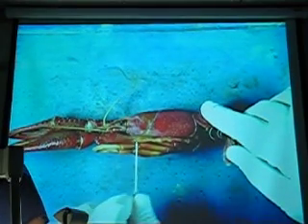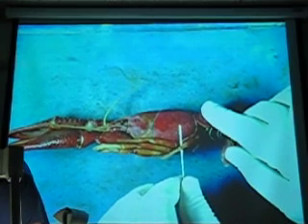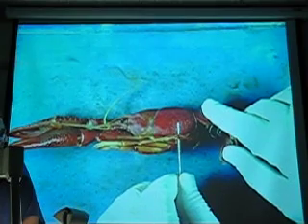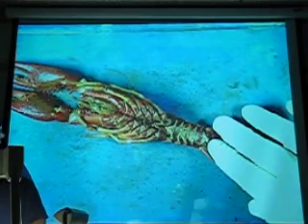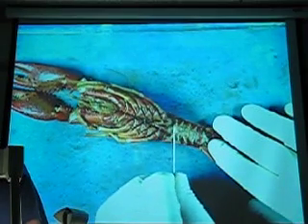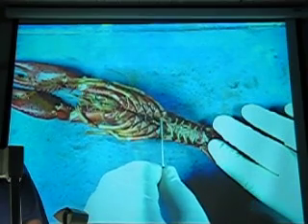What are these? Count the five first, Vincent. You put yourself on a four timer. Those are periopods. And then what are these? Pleopods. This is a male, because these pleopods are modified for copulation.